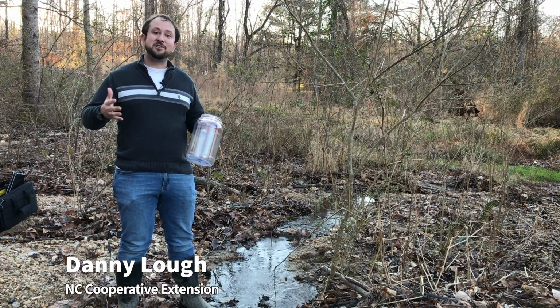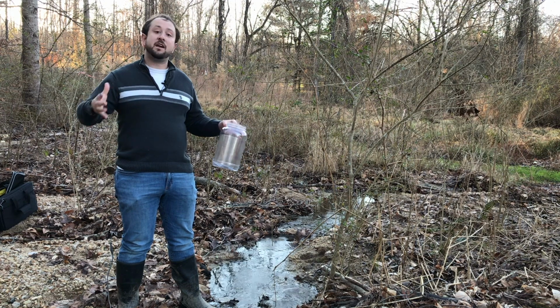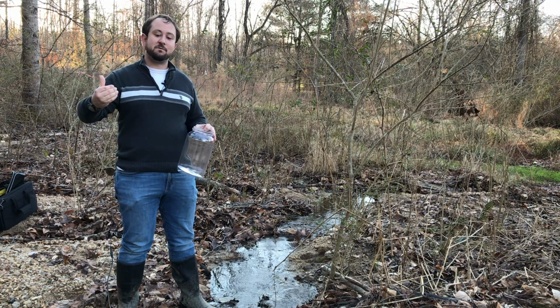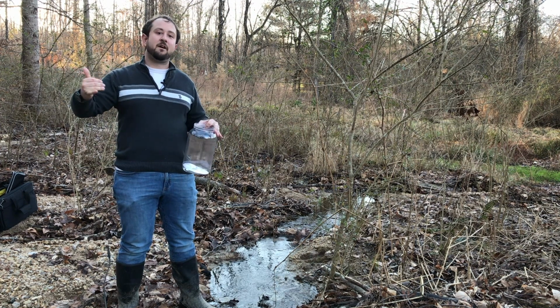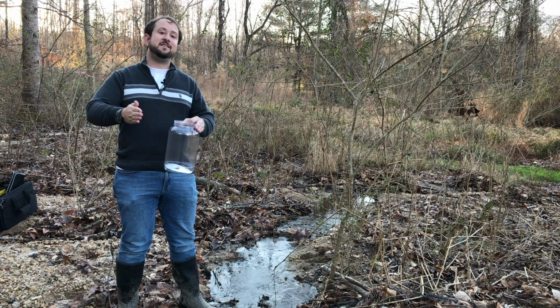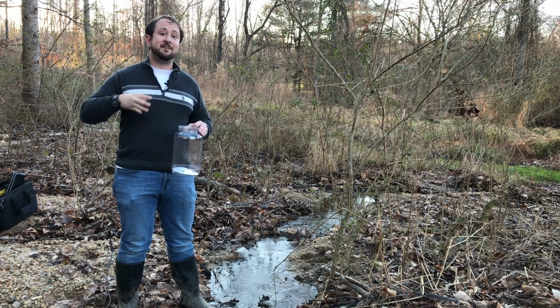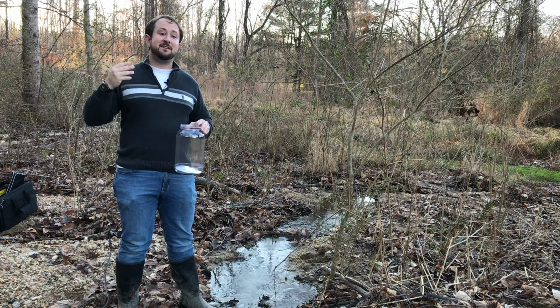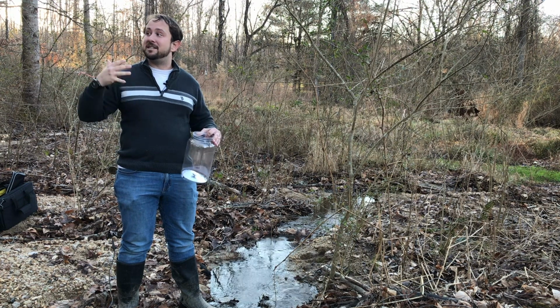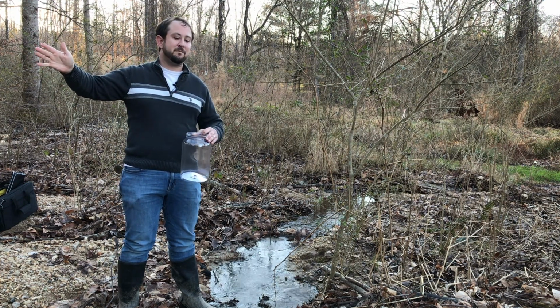So this is our first stream that we're going to sample turbidity with today. This is what we call a primary stream. It's a stream that is the first to gather the rainwater that falls on the surface and runs off into a river. Upstream of us is a neighborhood in this case, and that neighborhood is probably about a quarter of a mile upstream from here.